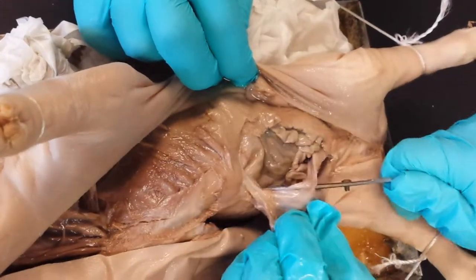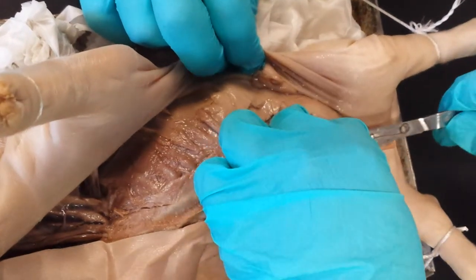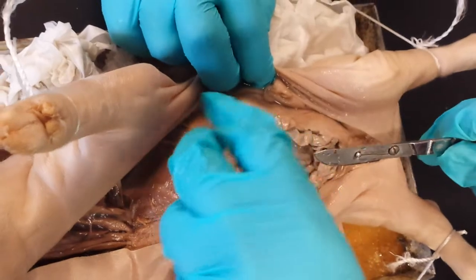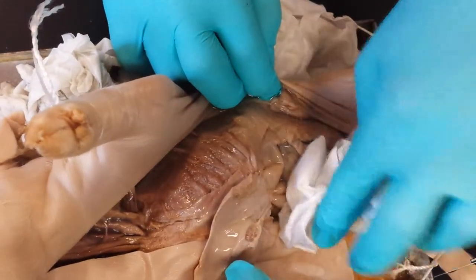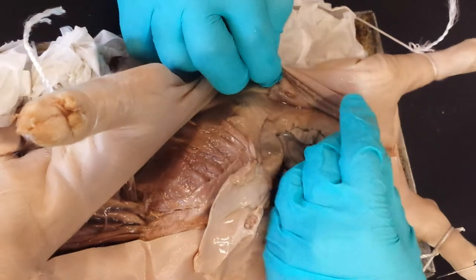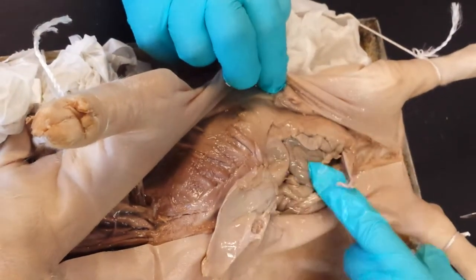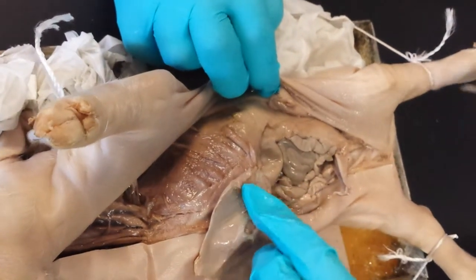You've done live animal dissections? Huh? You've done live animal dissections? Oh. As in kill it so you can eat it. Oh, okay. Yeah. Okay, what's your thing? Okay, yeah. Females have a little extra papilla, right? In front of their anal. No, Pete. This thing, what is this? This is broken. That's rude.